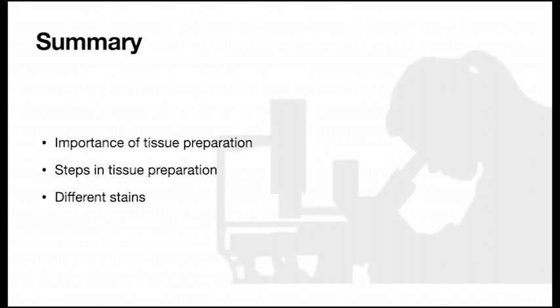In summary, I have discussed the importance of tissue preparation, the different steps that are utilized in tissue or slide preparation, and the different stains or special stains that can be used in order to visualize specific structures.